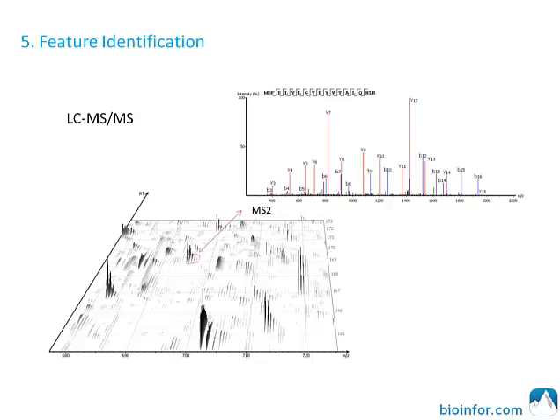The last step is peptide feature identification, done using the MS/MS spectra associated with the feature. PEAKS label-free quantification is seamlessly integrated with PEAKS database search for peptide identification, thus data analysis is much easier than switching software or exporting from one format to another.